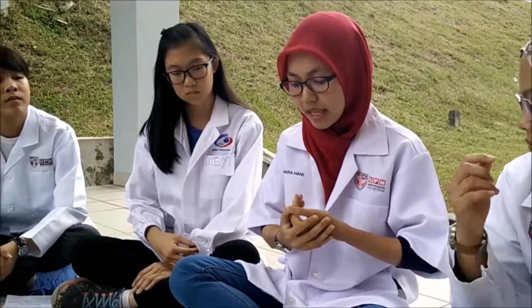Besides that, since the cuvettes and test tubes have different maximum volumes, load the proper volume of each sample into the container. For example, the cuvette has a maximum volume of 1 milliliter and the test tube has a maximum volume of 5 milliliters. So load the sample according to the maximum volume of each cuvette and test tube. As long as the light beam passes through the liquid and not the empty part of the container, the machine will give the result accurately.